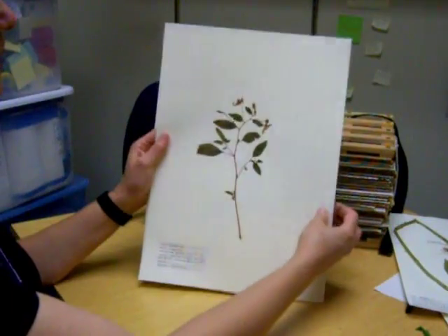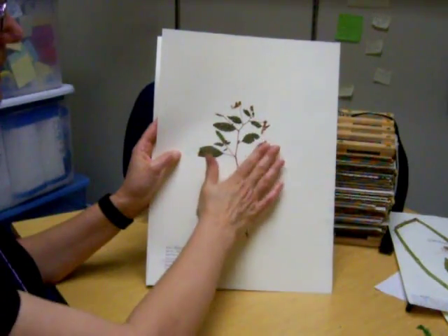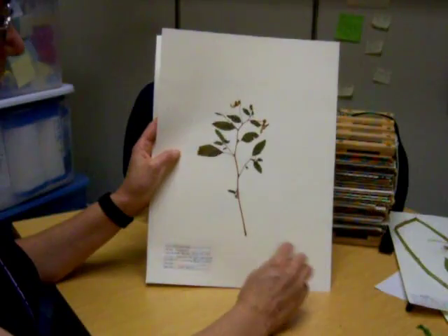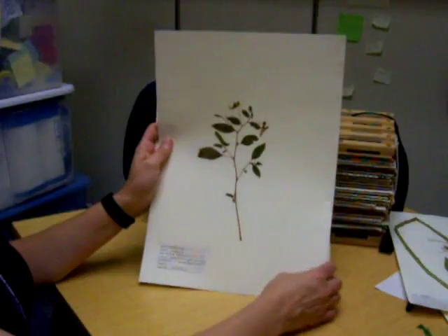This is an example of a plant where the flowers have been pressed and the leaves are very carefully laid out so that they are nice and flat. It's gone down to the roots but didn't include the roots.